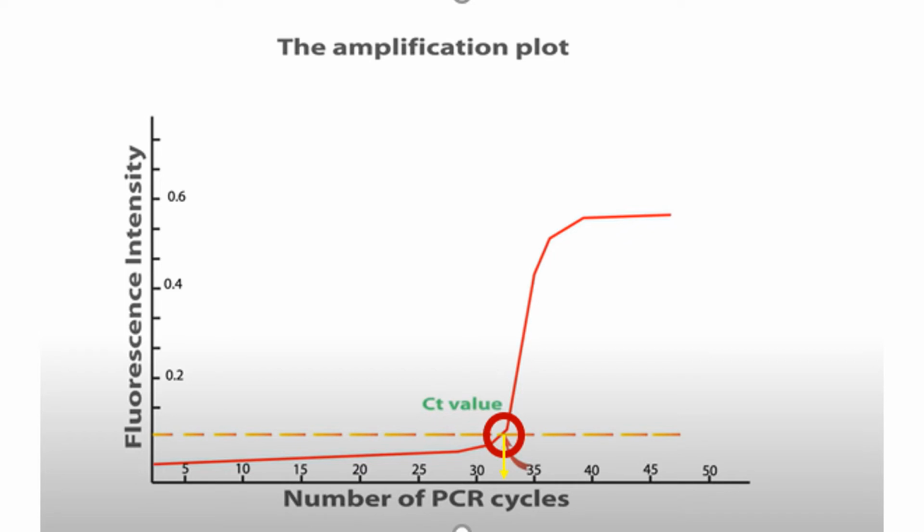If the cutoff CT value for this test is 40, what is the interpretation? Is it positive or negative? Again, it is a positive. Since it is below 40, meaning the amount of analyte in the sample is high, so it takes a lesser number of cycles to amplify that specific target. So if it is below the cycle cutoff, then it is positive.